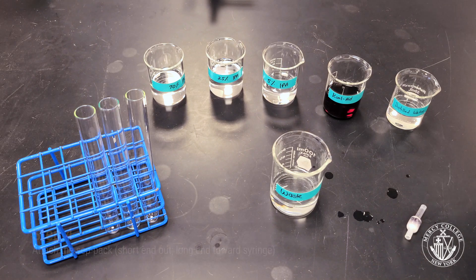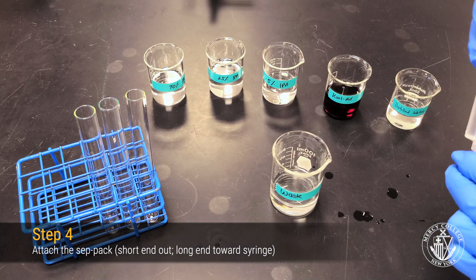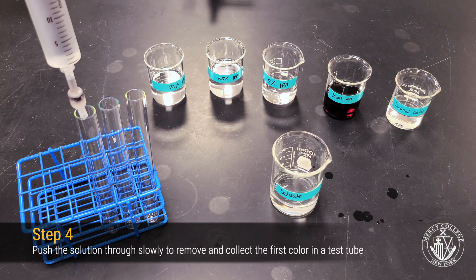After you've drawn up the 5% IPA solution, reattach the CEPPAC column, again making sure the long end with the propyl coloring is facing toward the syringe.